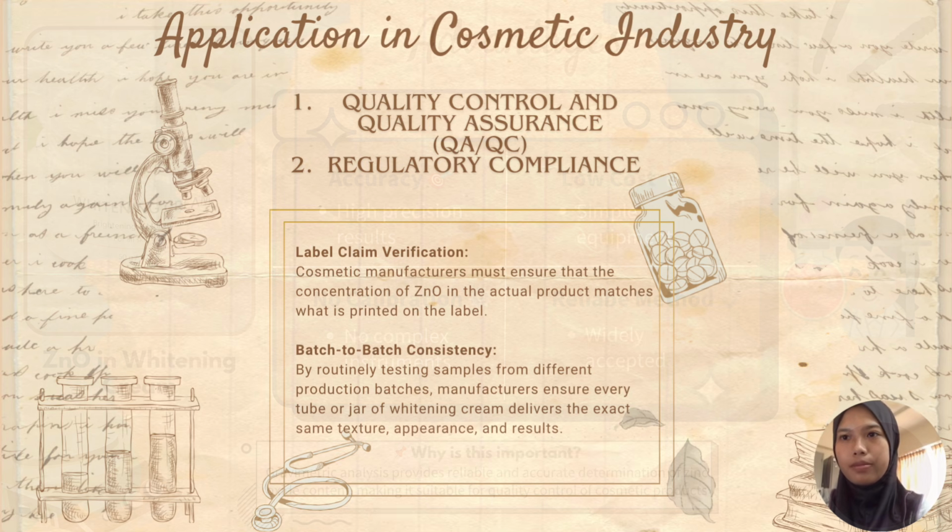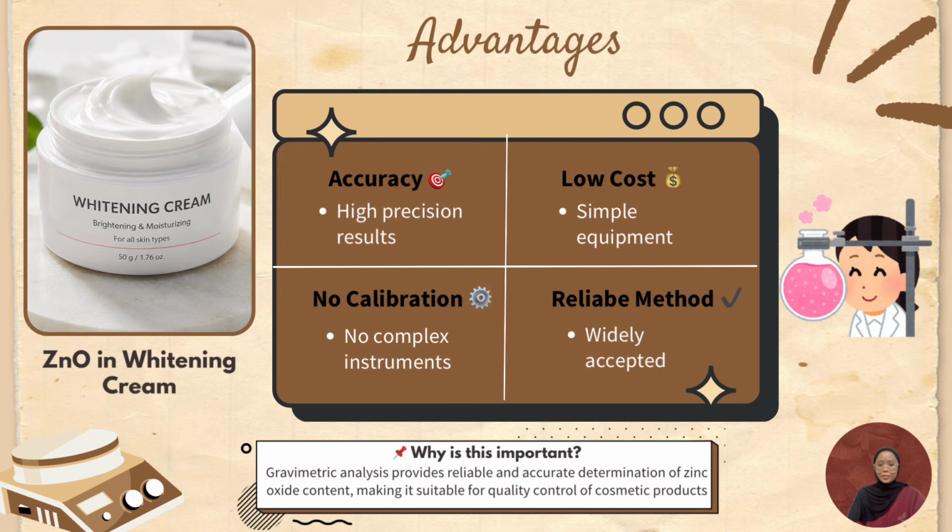the product. Hello everyone, my name is Nuralish Binti Muhammad and I will be presenting the advantages, limitations, and conclusion of our gravimetric analysis for determining zinc oxide in whitening cream. Let's begin with the advantages.